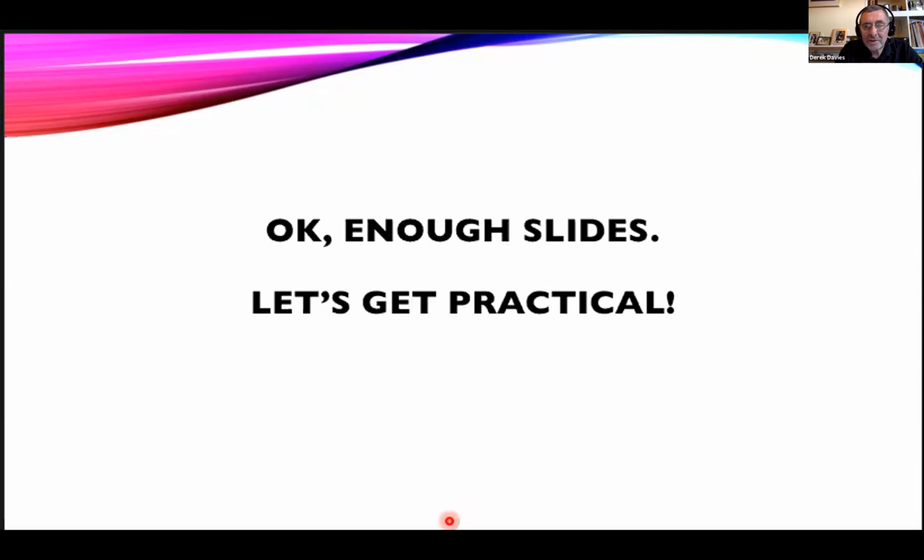Okay, that's a good question, actually, because those 6 peak beads that we use are generally not completely optimal for every laser and every channel that we measure. So particularly in the far red channels, we don't always see the 6 or the 8 peaks. The beads that we're going to use now have been optimized for each laser and each channel. So although we use 6 peak beads as a quick look-see, if I was really wanting to quantify the QC of my machine, I would use the CS&T beads that we're going to use now.